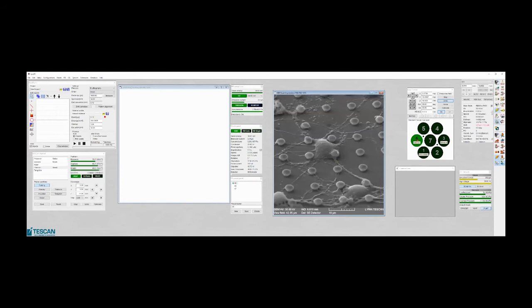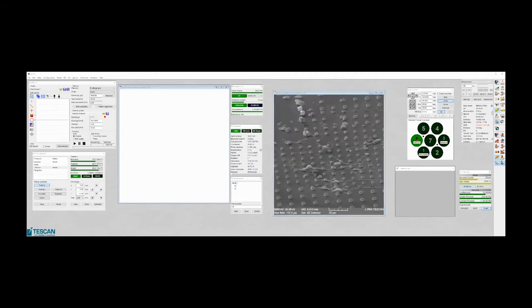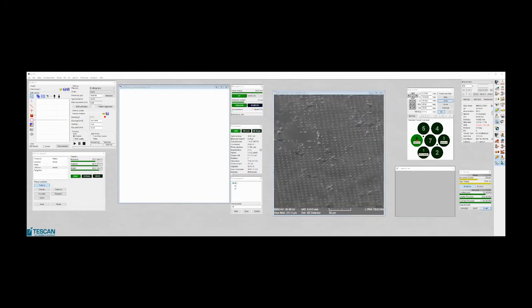So there were prepared several different sizes of those contacts, with different distances between them. The one here has distances which were too big. If you check, these cells are lying between the contacts and not on top of them. But for our purposes, never mind.